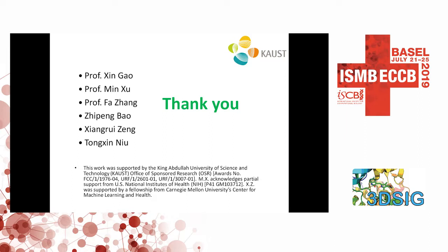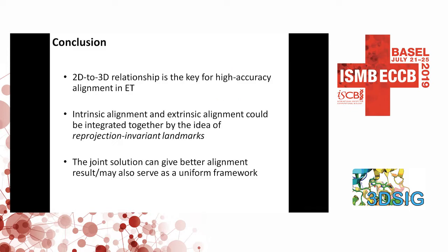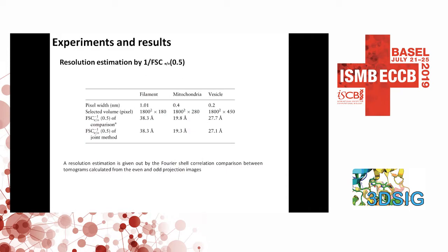What's the minimum resolution of what you can? What do you mean by resolution? In terms of nanometers or angstrom? It's angstrom. Yeah. For electron tomography, the general resolution is around nanometers. Yeah. Thank you.